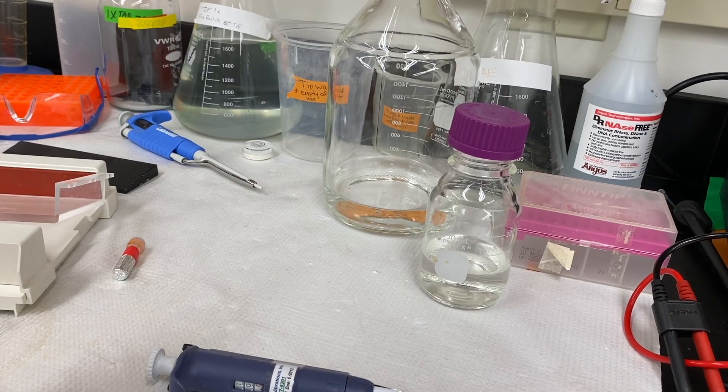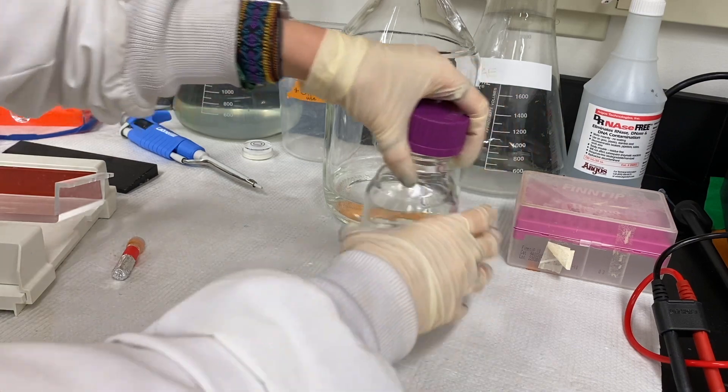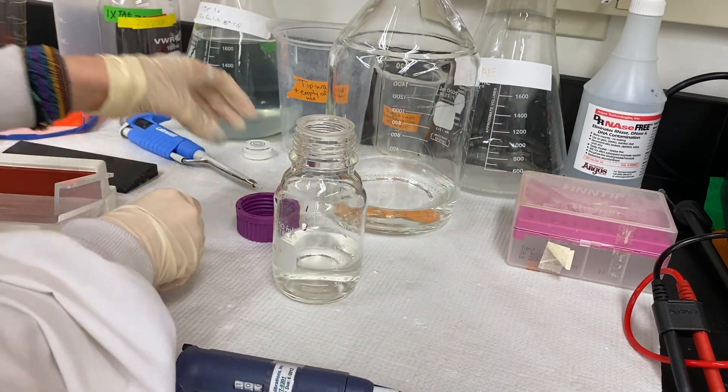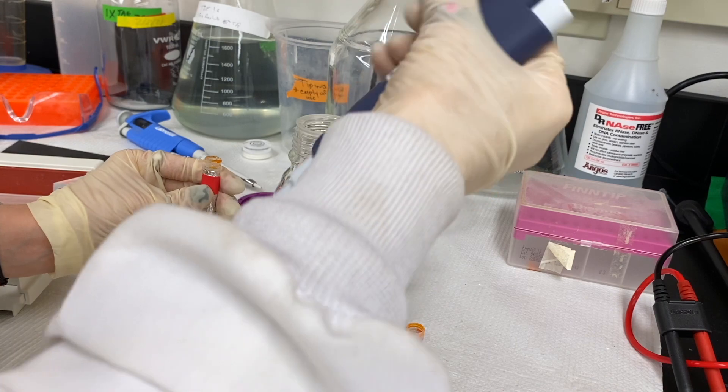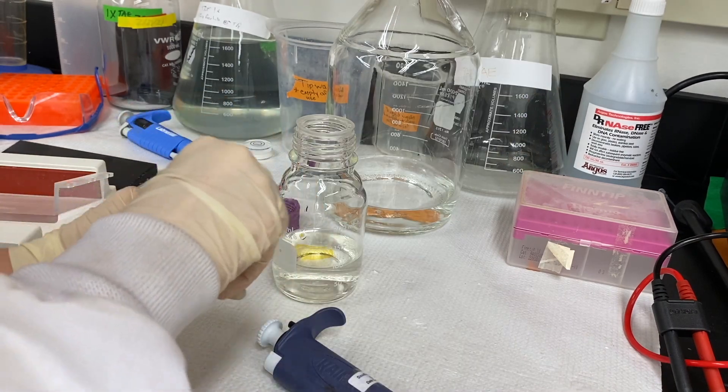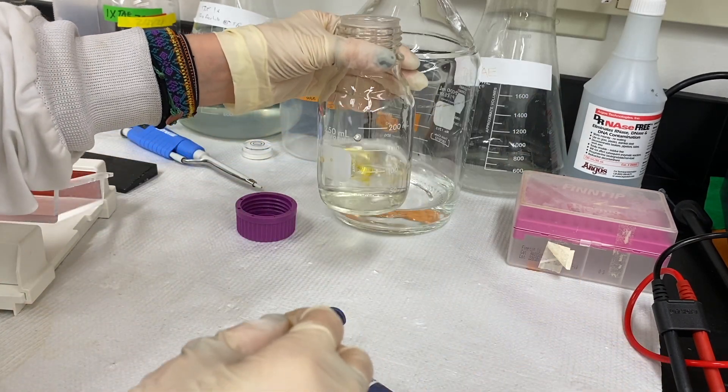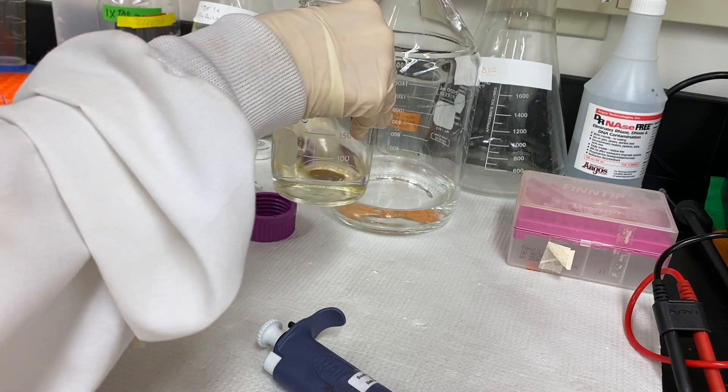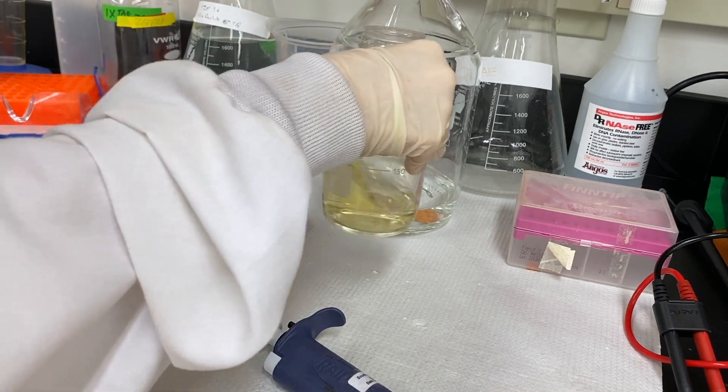It is then left on the counter to cool down for a few minutes before I add a fluorescent dye that will allow the DNA to be visible once they are added to the gel. The dye is covered in tin foil because fluorescence is sensitive to light, so for the remainder of this project, I'm going to make sure to cover the gel with tin foil whenever I can.